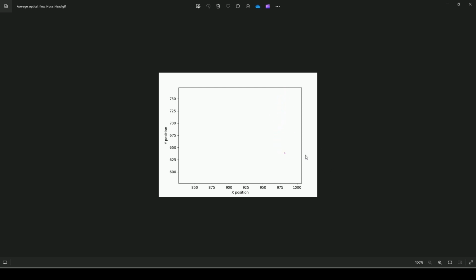Many of the large velocity changes are because of something called jitter. It's a random fluctuation happening in my data set because the likelihood values are very low for the localization of body parts. Here you can get the idea of which direction the mouse is moving in, and perhaps for some of you this would be useful, for others it may not be. But for my experiments, I wanted to see the directional change layered on top of the positional change for my mice.